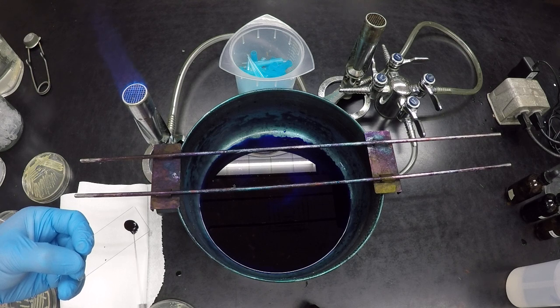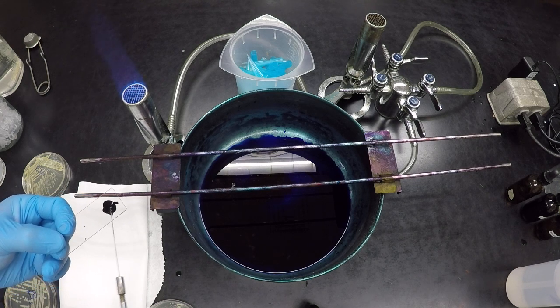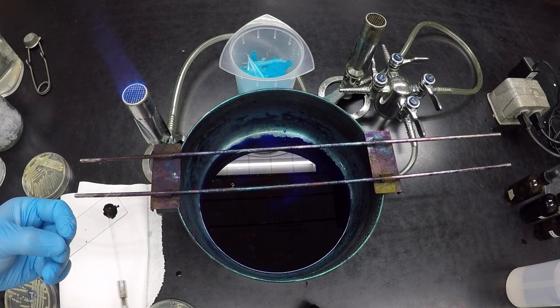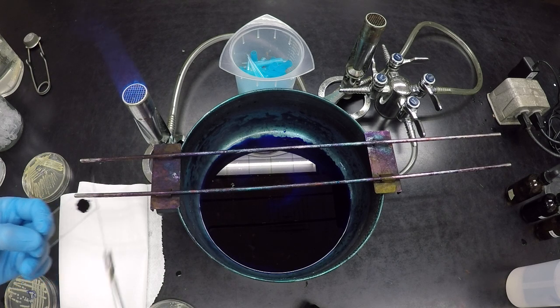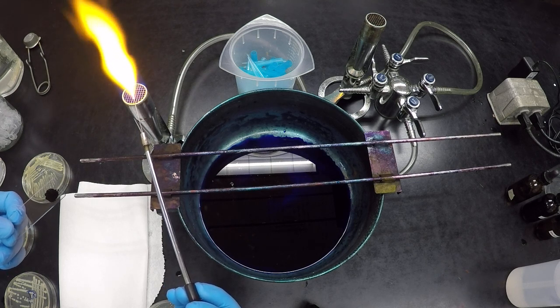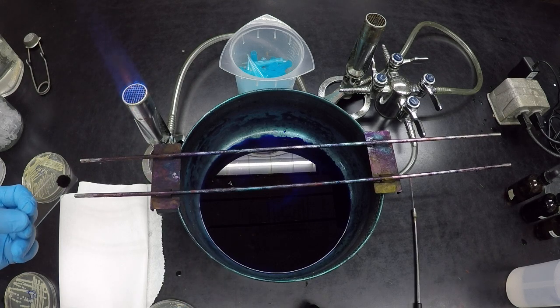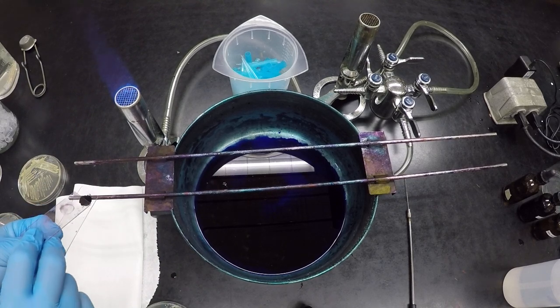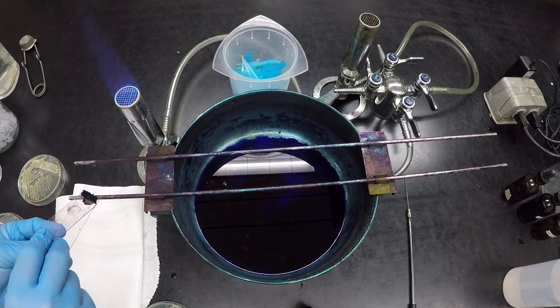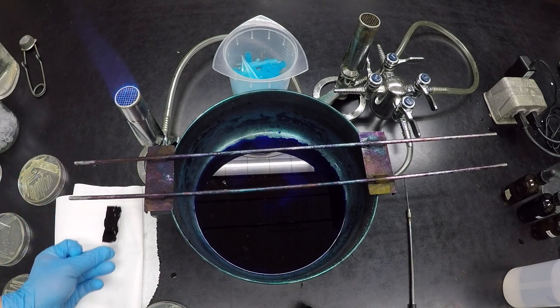Now, because of the capsule, the bacteria is going to be a little bit sticky, so do what you can to work the bacterium off into the nigrosin. It's not going to be easy. Just do what you can to get it off. And then this thing's going to sizzle. Okay, so a little bit longer than normal. Put that away, and then we take a second slide, just dip that in there like that, and then you can either pull or push and cover the whole slide.